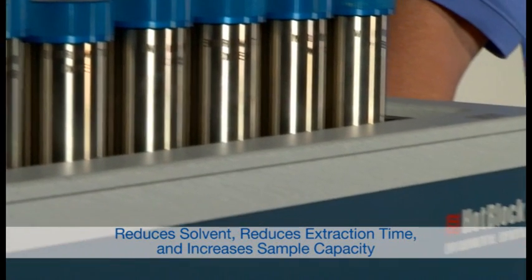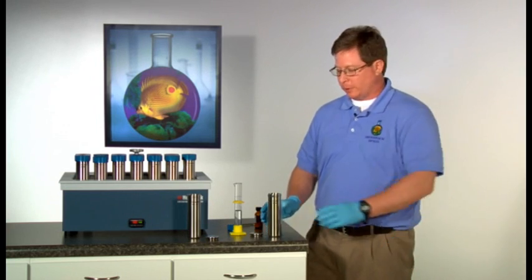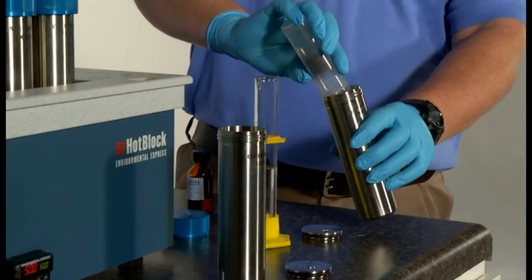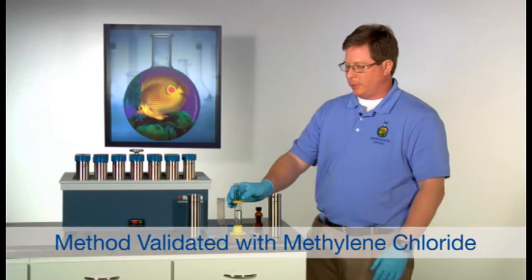The first step is to weigh 10 to 30 grams of sample into the soil extraction cell. Next, add 30 mils of the appropriate solvent.